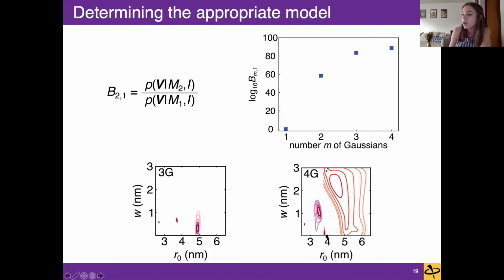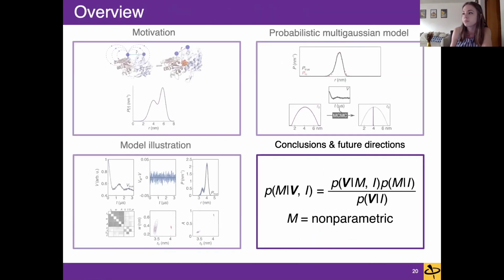We have a much broader range of data, which means the method really wasn't sure what to do with some of those longer distance peaks. So that all being said, combining all of this, we would probably say that the 3 Gaussian is the most appropriate choice, and this just highlights that it can be fairly difficult with an experimental case to choose the appropriate model, and it's essential to compare the different models with one another before choosing.